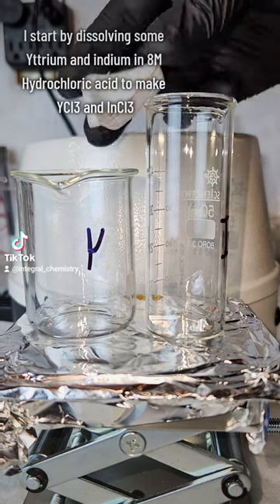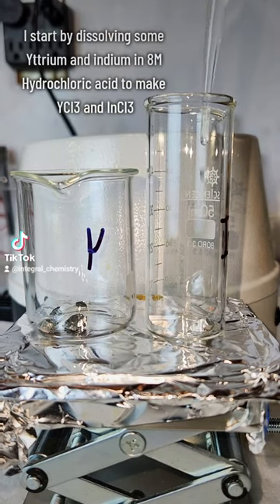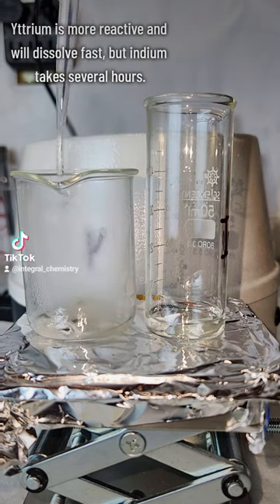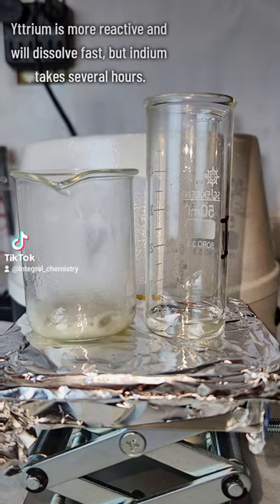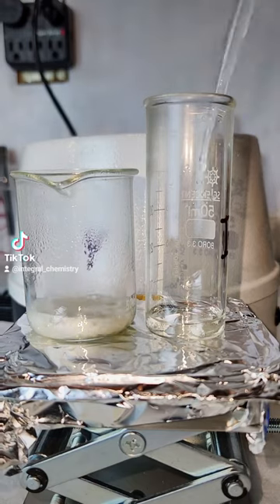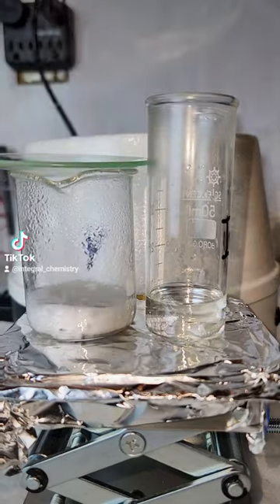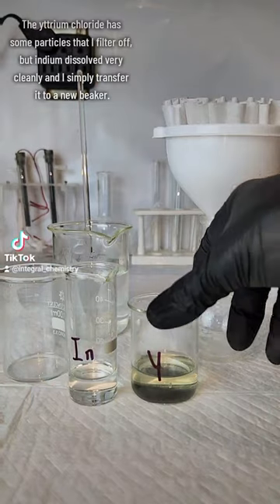I start by dissolving some yttrium metal and indium metal in 8 molar hydrochloric acid to make yttrium chloride and indium chloride. Yttrium is a highly reactive transition metal and will dissolve pretty quickly, but indium is a fairly unreactive by comparison post-transition metal, and it takes several hours to fully dissolve.